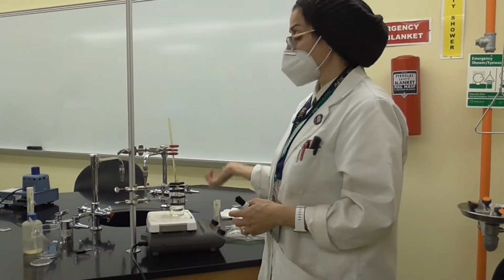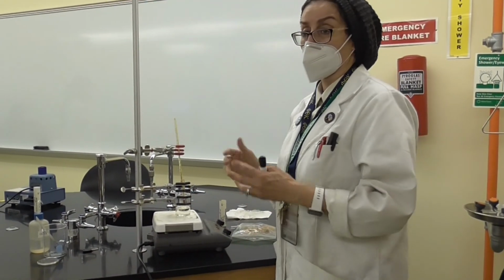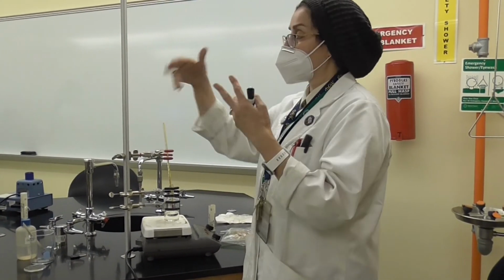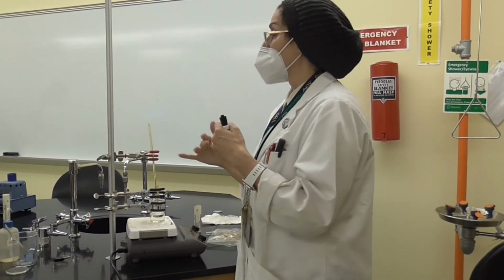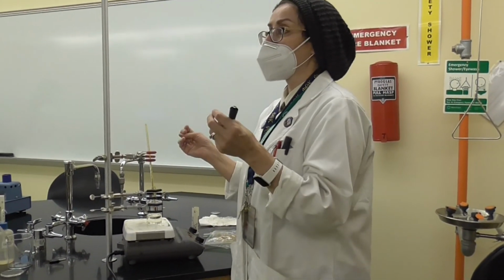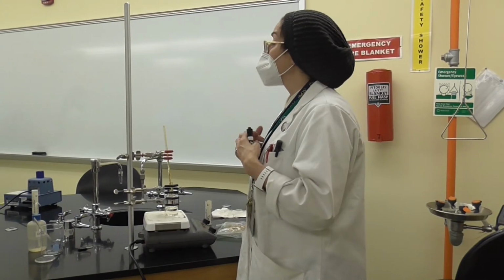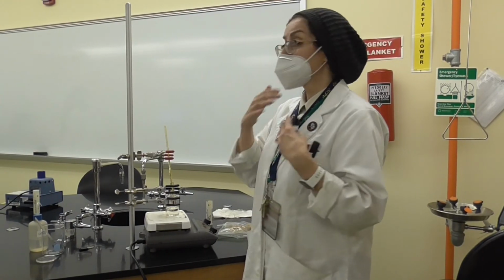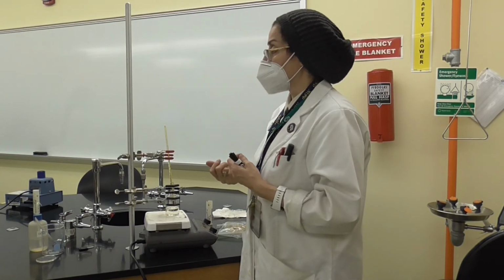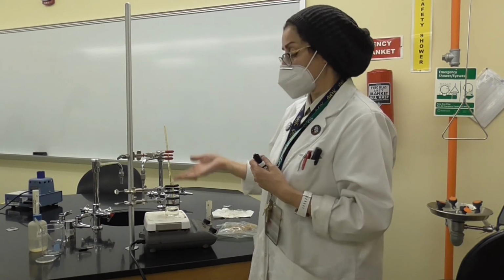For the boiling point, you can use each one at a time. It's up to you. If you have 4 liquids, you're going to use 4 of them when pure, and then you're going to mix any 2 and see how the boiling point changes. That is a very good exercise and a comparison that we are going to be able to address today.